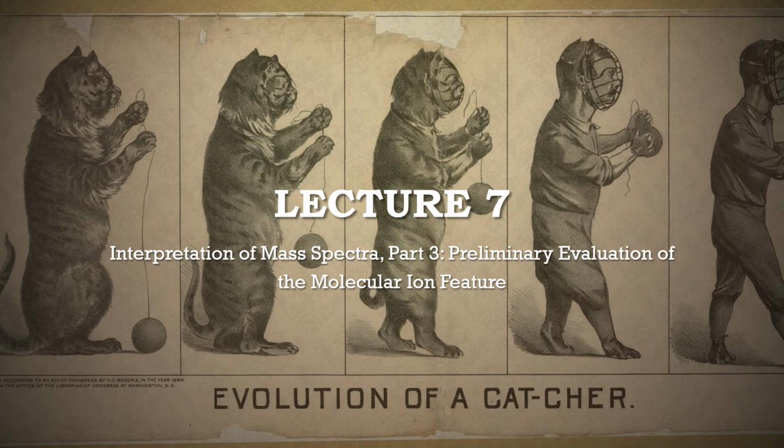This is lecture 7, part 3, and in this particular part, I'm going to focus on preliminary assessment techniques as applied to the set of peaks that have the highest M to Z values. So presumably what you would think to be the molecular ion as it passes through the mass spec analyzer.